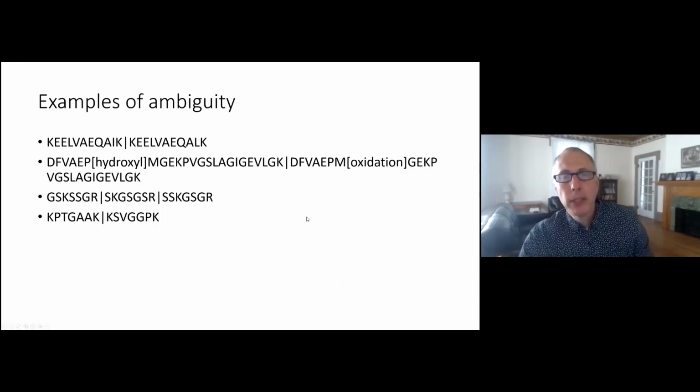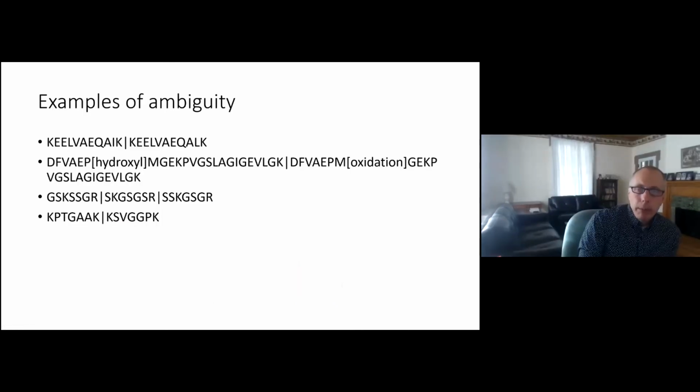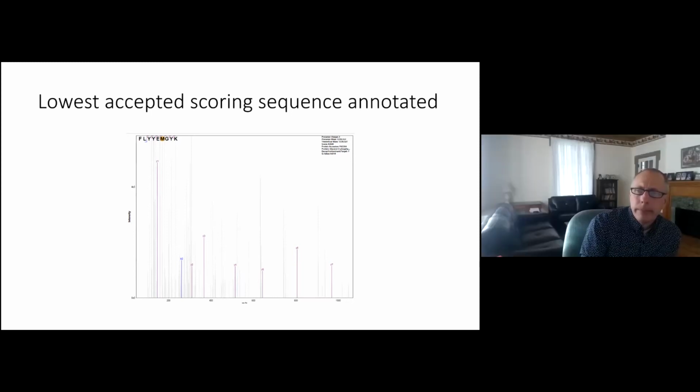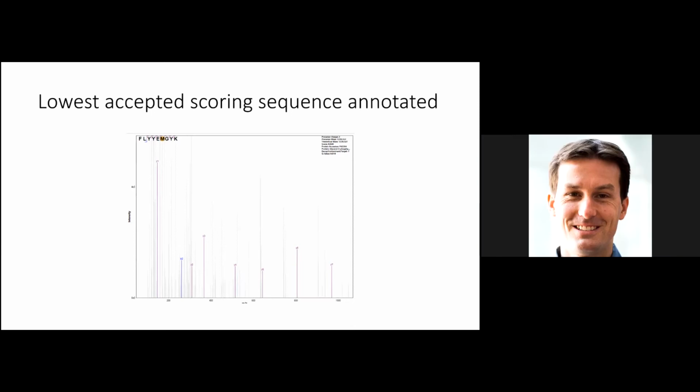Okay, I mentioned ambiguity before, but I asked a question on the last slide. So this spectrum would be for just one particular mass that would match the mass of that peptide you show here. That's right. So all of those other peaks, it can't be the case that this is actually a much larger peptide that would give you all these additional peaks. So the best explanation is that there are multiple peptides with the same mass that are all in the same group?